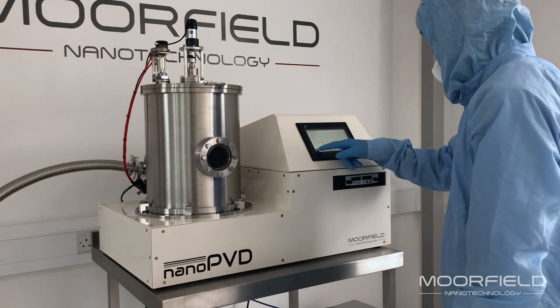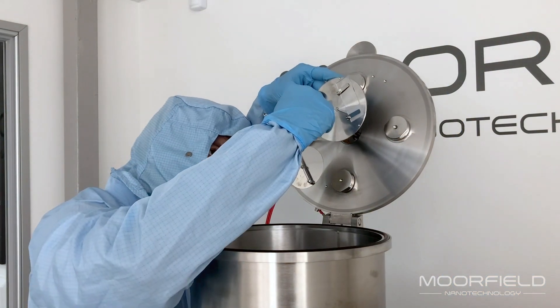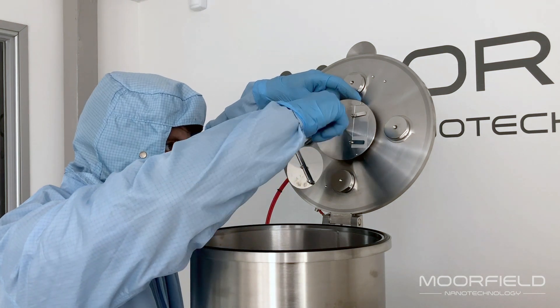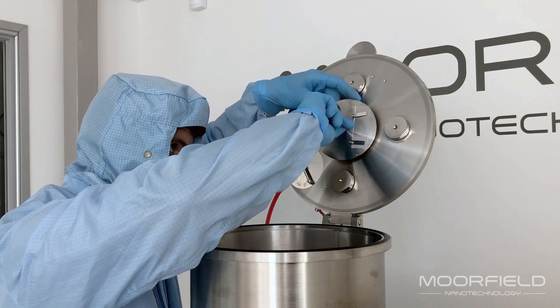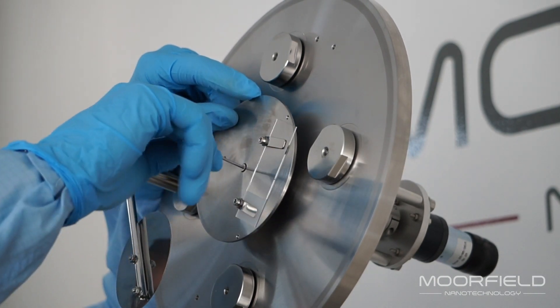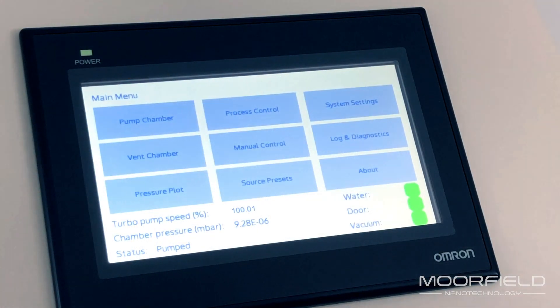Substrates up to four inches in diameter are mounted to the stage at the top of the chamber. Loading and unloading substrates is easy. Substrate rotation, heating, and z-shift are all available.